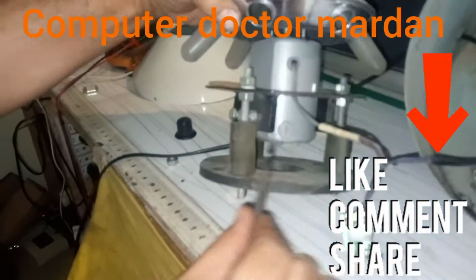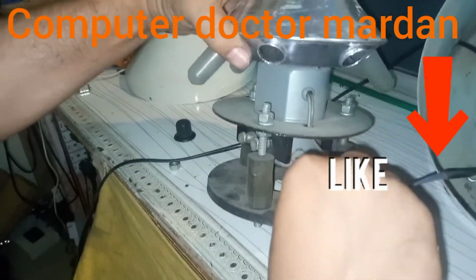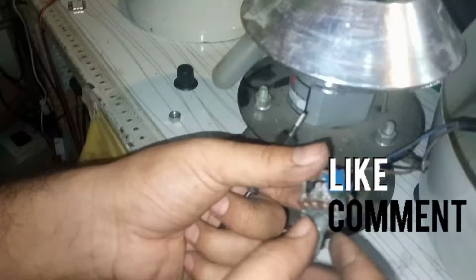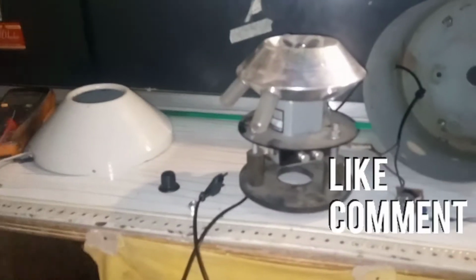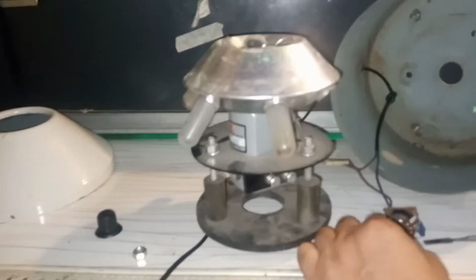So you see there is a carbon side. I fix that, and the other side. Now I check this power. Whoa. So again I fix the power cable. You can see now.